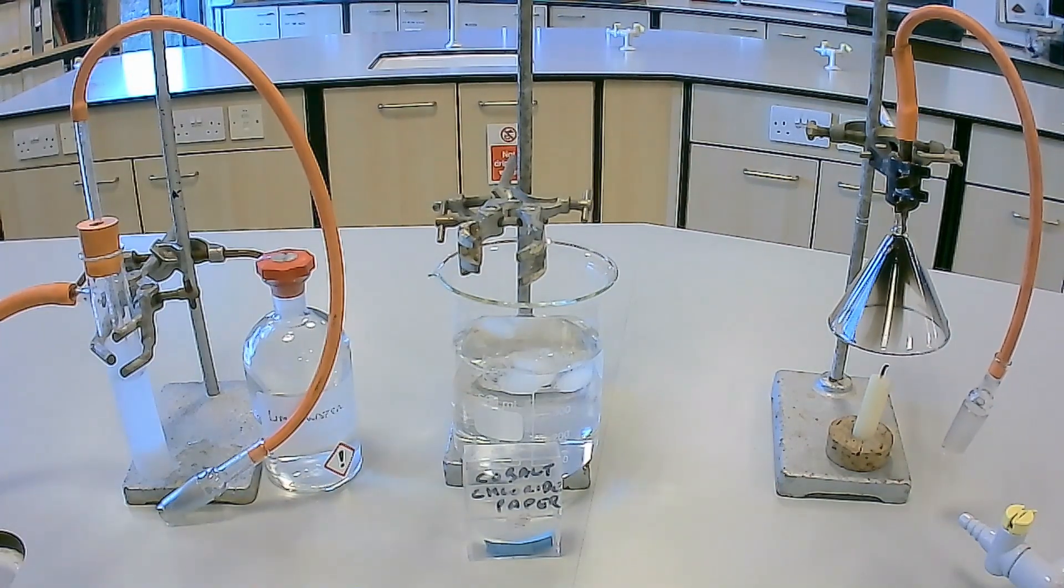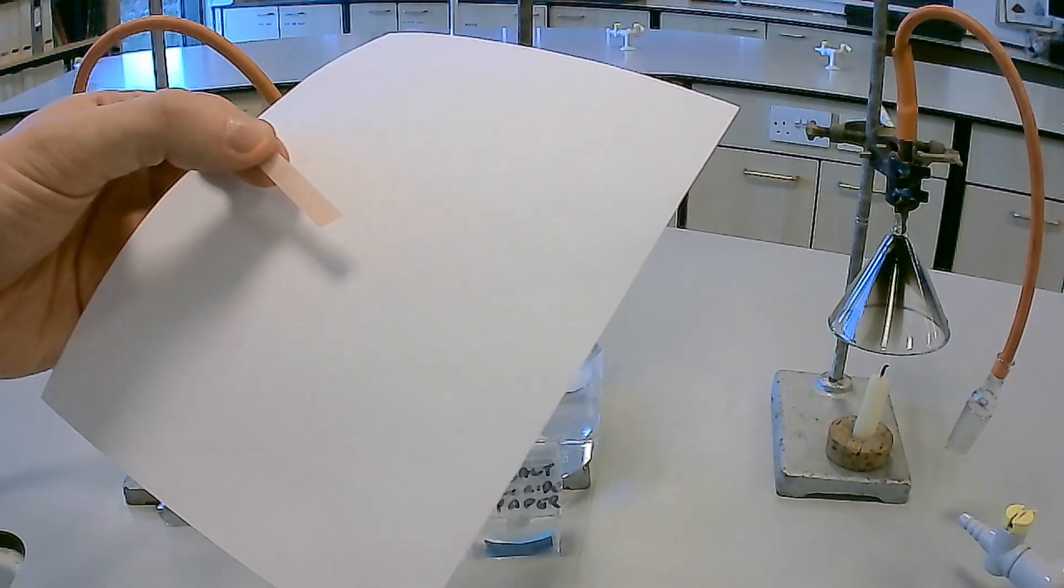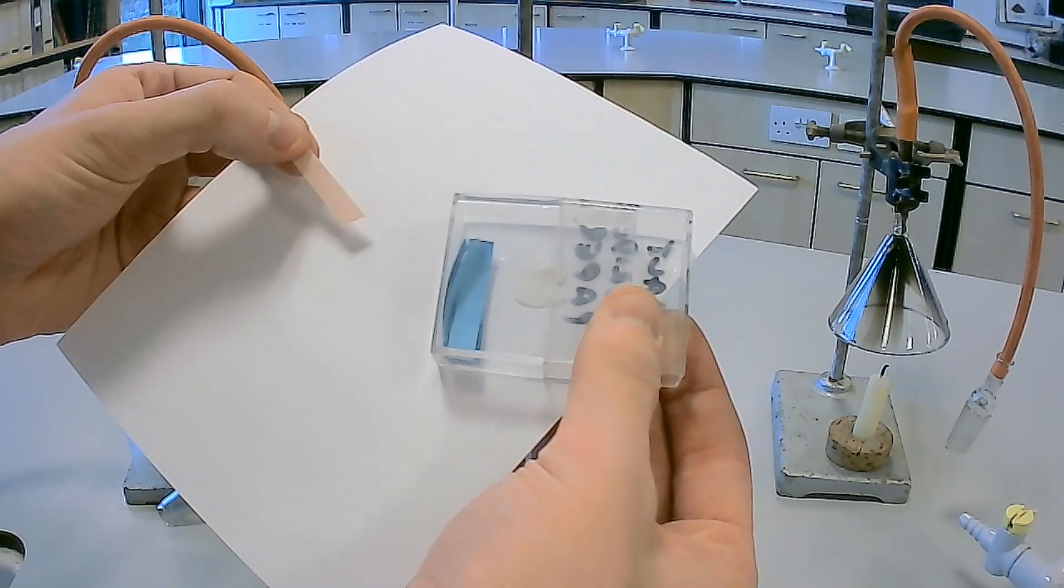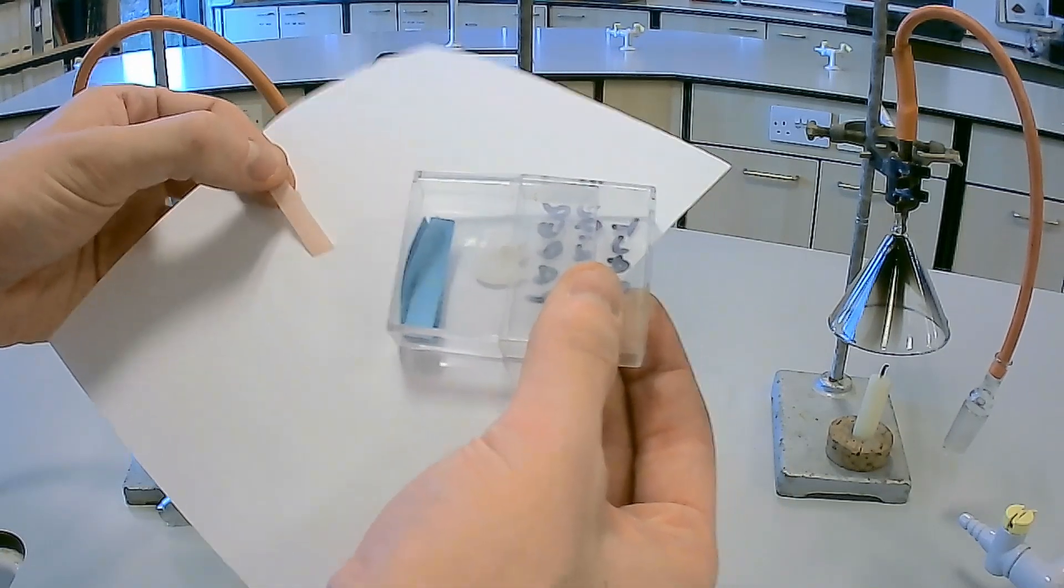As we inspect the cobalt chloride paper in the U-shaped tube following the combustion experiment, we can see that it has changed color from blue to pink. This indicates the presence of water in the combustion products.